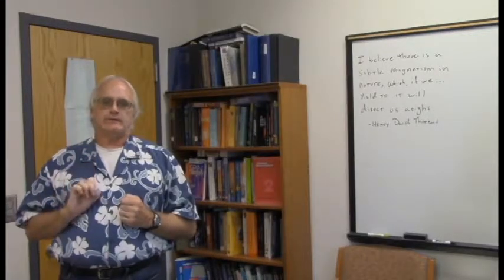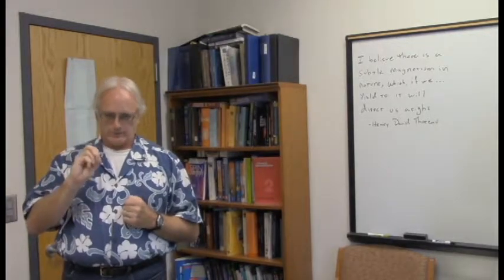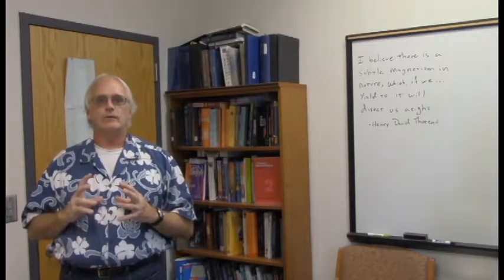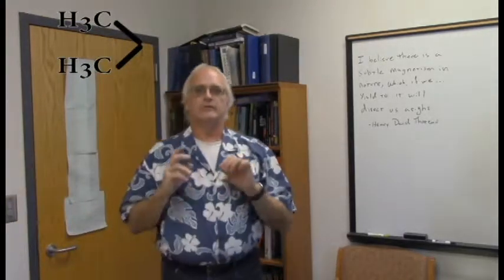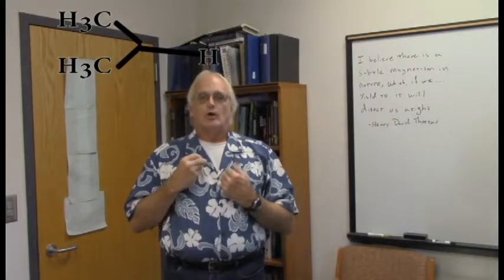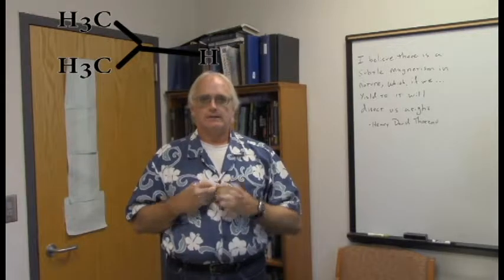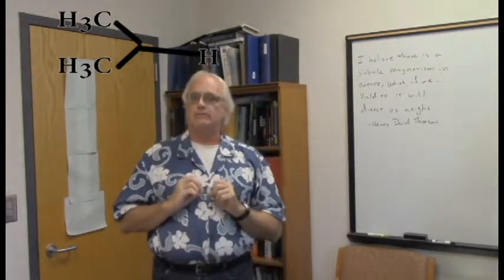Now by doing this in the COSY spectrum, starting at the position we know, going to the crosspeak, turning, and then moving to the other axis, in a sense, what we have done is essentially jumped from a position we knew to a position we now know very well. The single proton must be a CH group that is coupled to the 2 equivalent methyl groups.